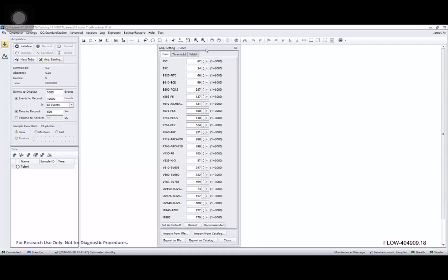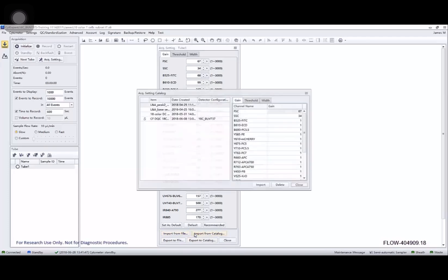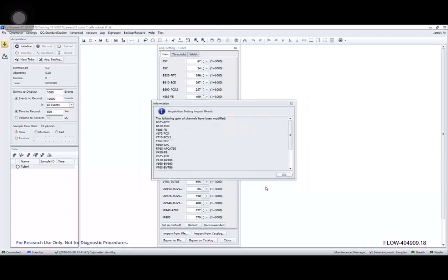I'm going to pull up my acquisition settings by clicking on acquisition settings and look at my gains. The default for a new experiment is recommended gains which are drawn from the QC results from the latest QC run. You can also import them from an FCS file, import them from a catalog, export them, export them to a catalog. I'm going to load in this standardized set of gains.